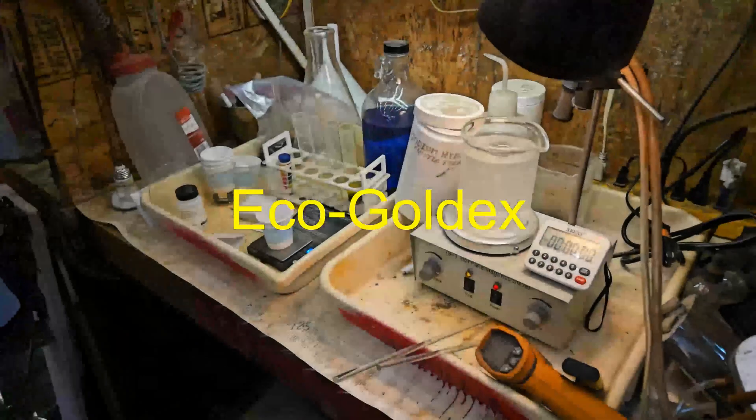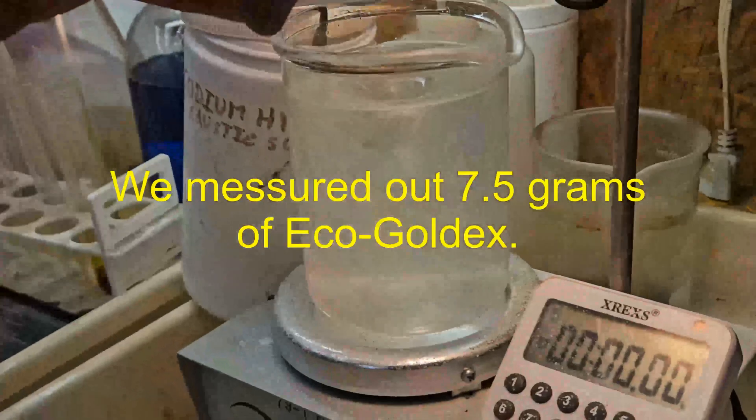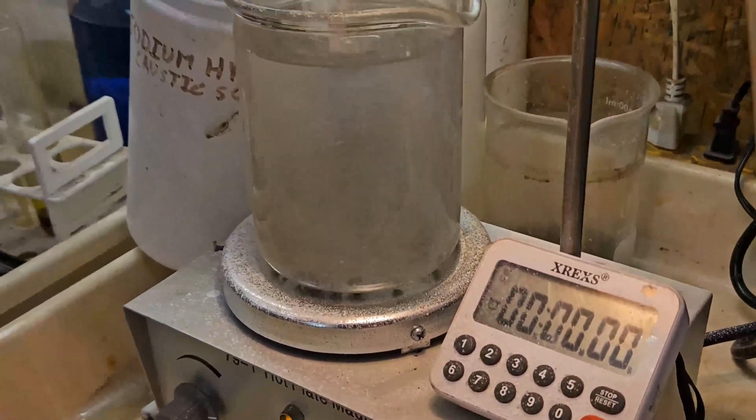Now we prepare the Eco Goldex solution the same way, except we add the Eco Goldex first because it will bring the pH up. Then we pH to 12, the same as before, and add the sodium percarbonate just before each test.